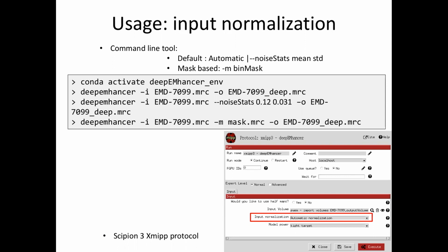Yeah, I would go tighter, if you don't mind losing these kinds of regions that you're not sure about. And if you have to pick one, I go tighter.